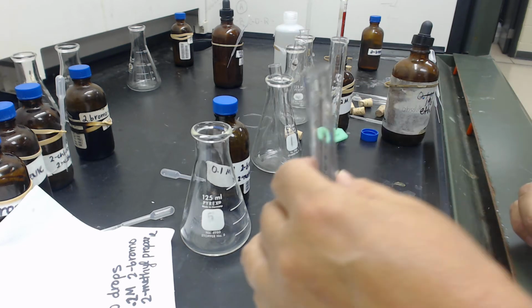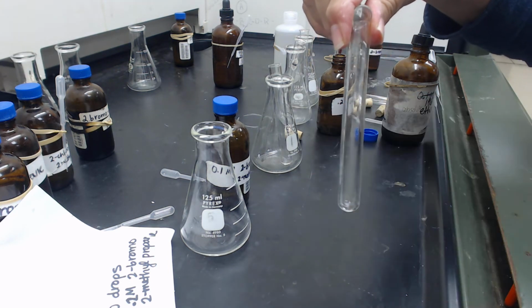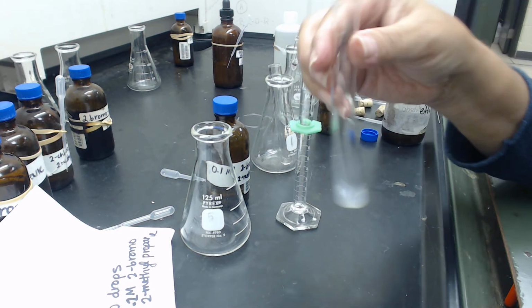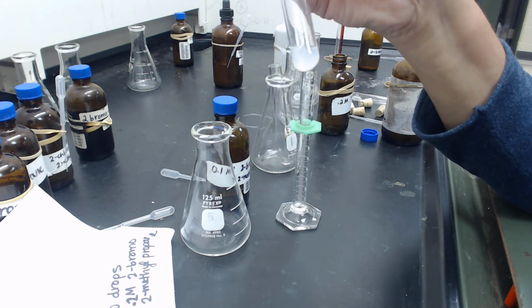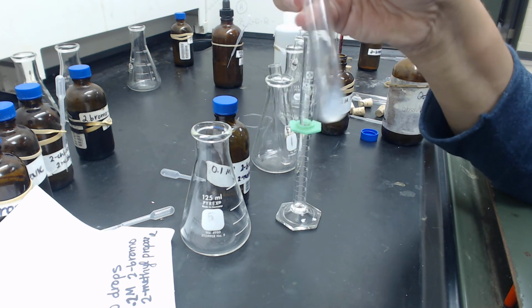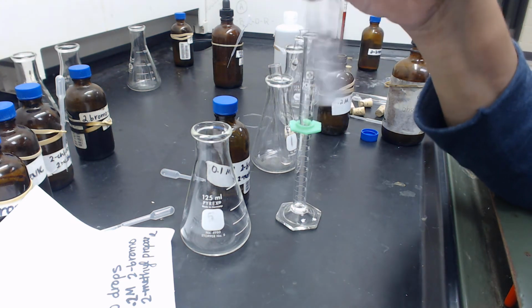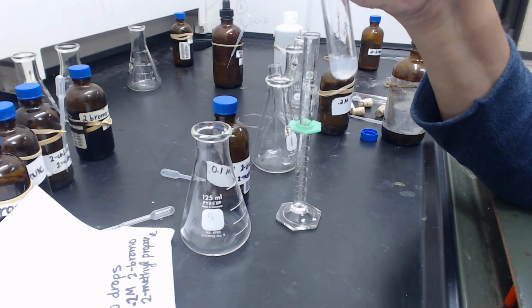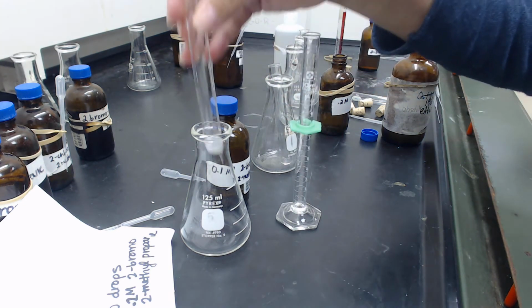I'm going to start my stopwatch as I add it. Let's see if I can have 3 hands at once. All right, ready, set, go. It got cloudy pretty quickly. The precipitate formed within a few seconds, and I'm watching it. All right, so let's stop it. Precipitate started forming maybe about 5 or 6 seconds afterwards. I see precipitate is continuing to form. Let's say 5 or 6 seconds.